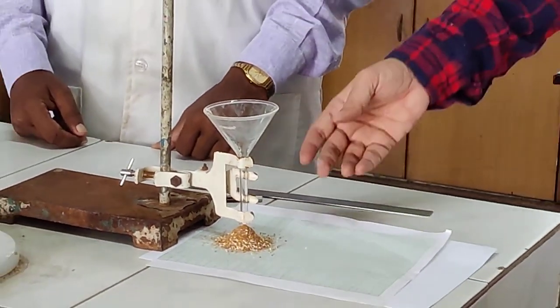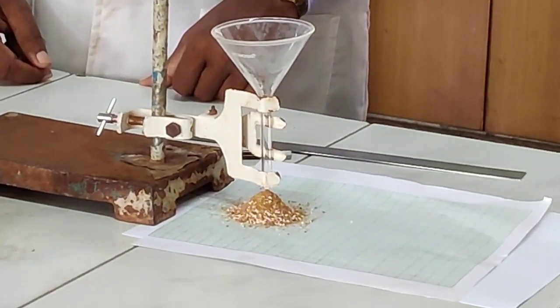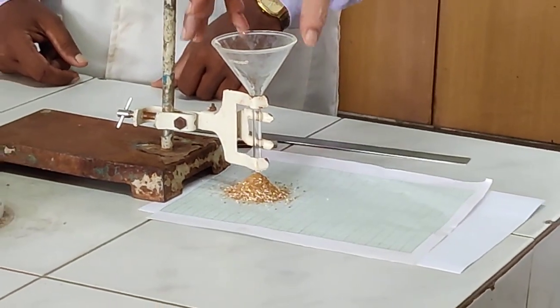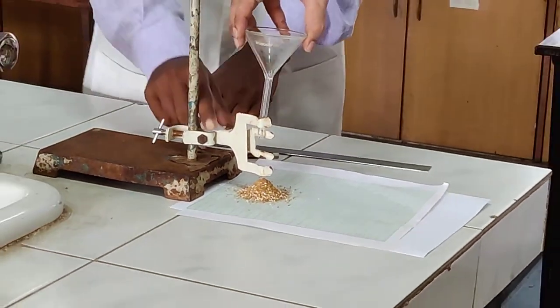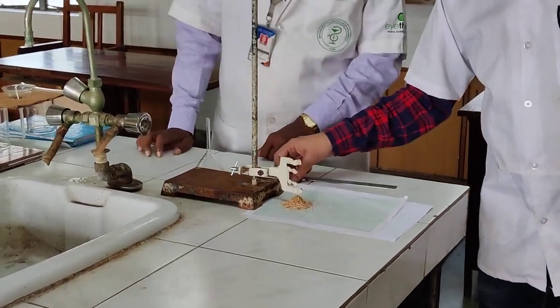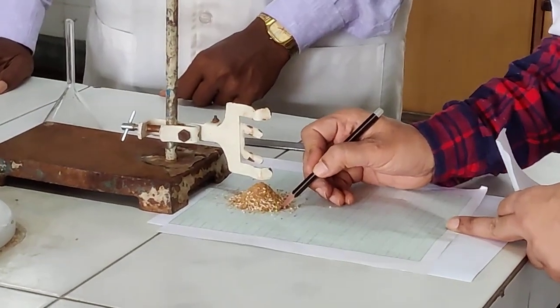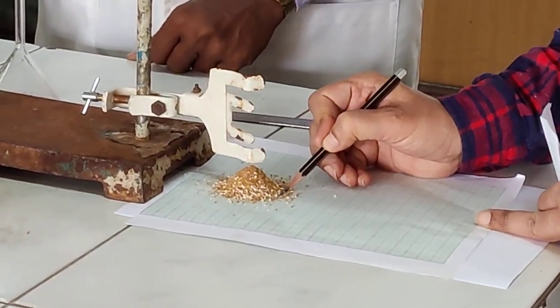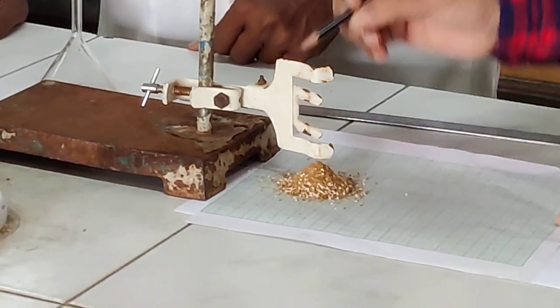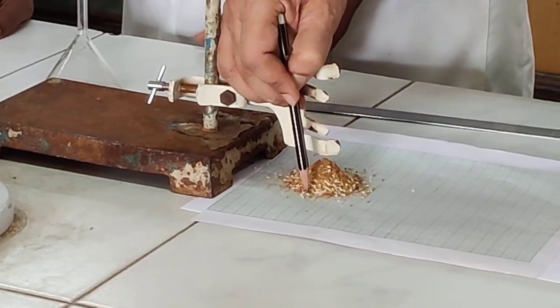You can see over here, Syed, you can show over here. You can see that the granules have touched the tip of the funnel, and the heap has been formed. Now you are going to remove this funnel, and then you are going to mark a circle. If you can please zoom, you are going to mark a circle around these granules with the help of the pencil that you have taken.